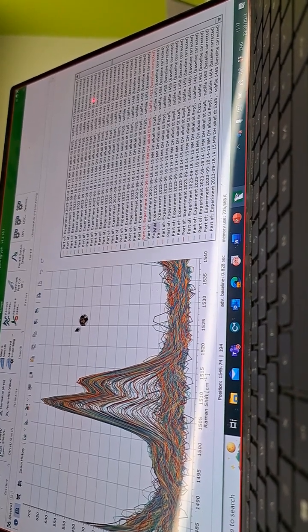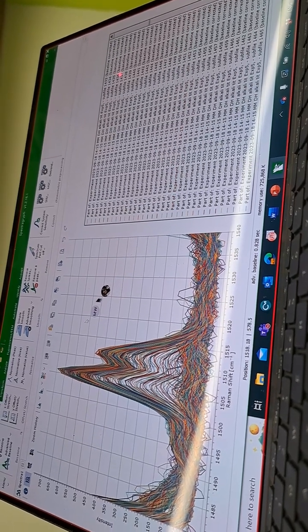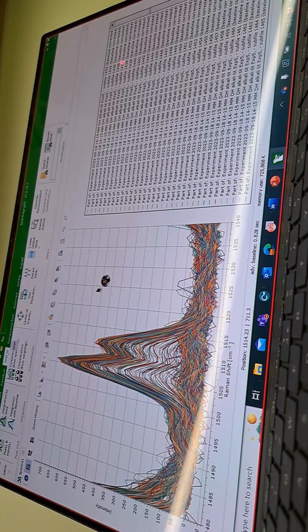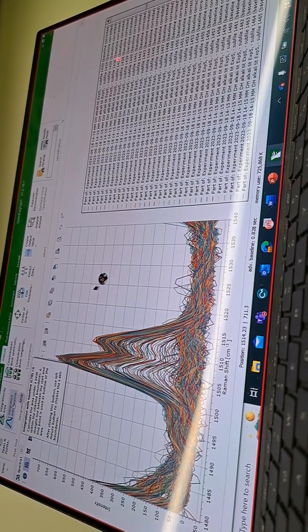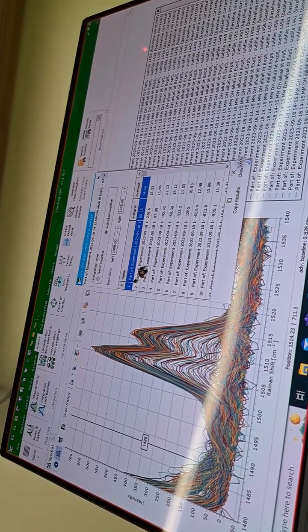Okay. In fact, I'll do it. So you are using the integration with baseline.